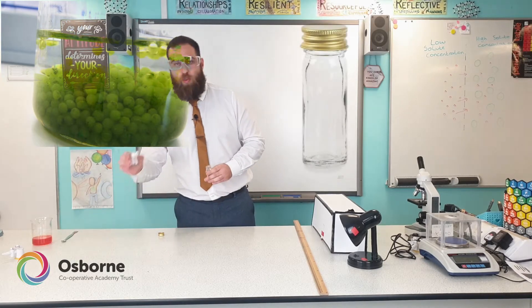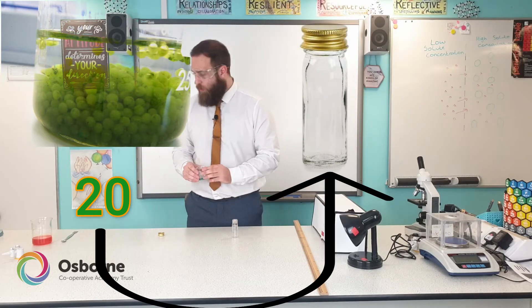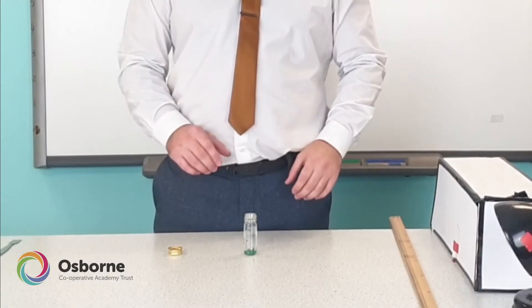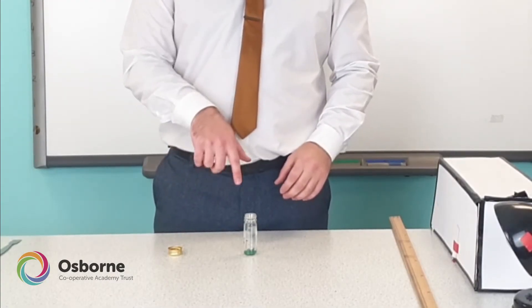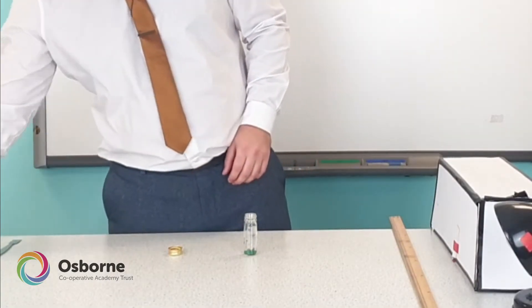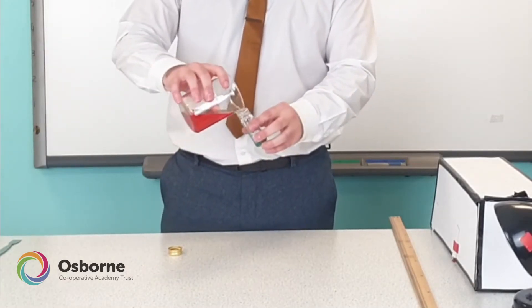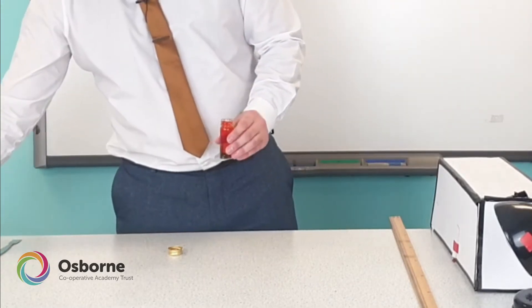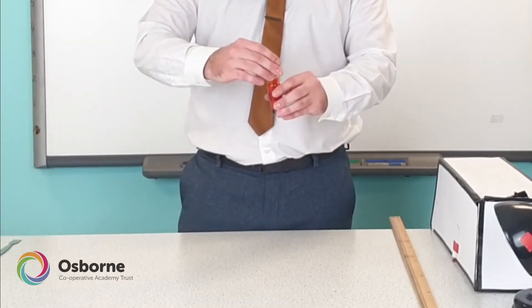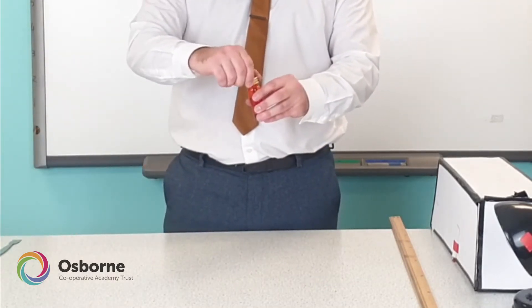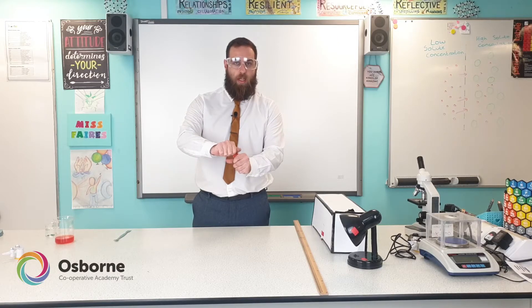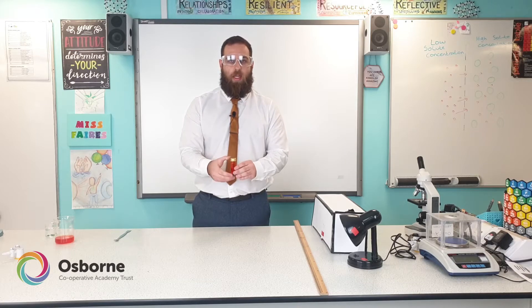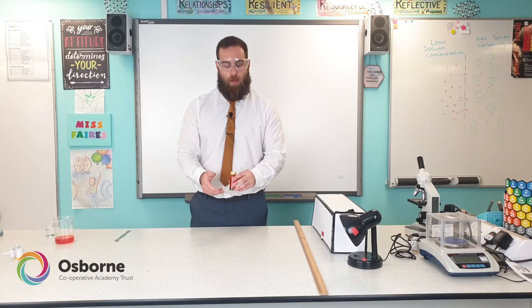We're going to put 20 of these algal balls into the Bijou bottle using our spatula. Now we've got our algal balls in our Bijou bottle, we're going to add the indicator and fill it to the top. This indicator will detect the amount of carbon dioxide present in the solution — it will change colour depending on the amount of CO₂. It will go yellow if there is more carbon dioxide present, and purple if there is less carbon dioxide present.